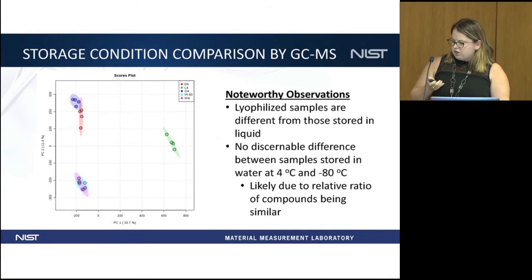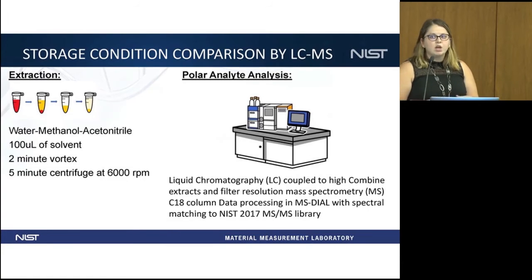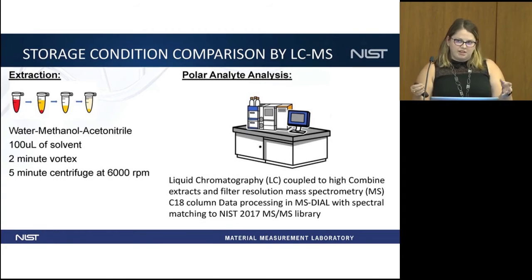Another thing that we've concluded from these data is the fact that the 2 proprietary buffers, we believe that they are lysing the cells, because those metabolic profiles look way more complex than those that are stored in water. And I think that one of the questions we really would like an answer to is, are we interested in solely the intracellular metabolites, or are we also interested in the extracellular components? Or I think I got that backwards. So are we interested in solely the extracellular metabolites as opposed to also the intracellular ones?